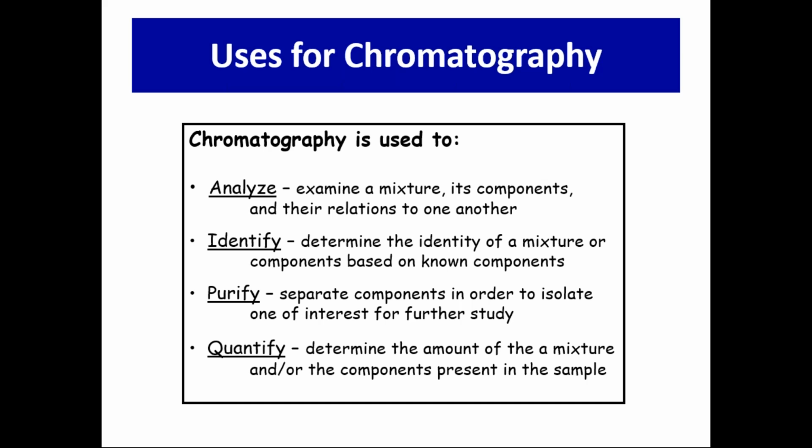Any compound could be identified by this chromatographic technique. Generally, chromatography is used to identify organic molecules or organic analytes.